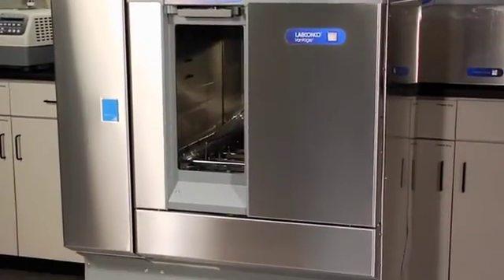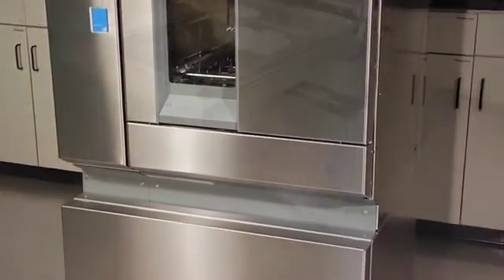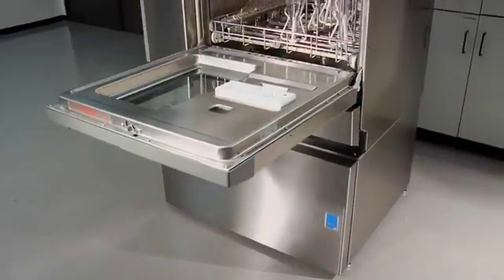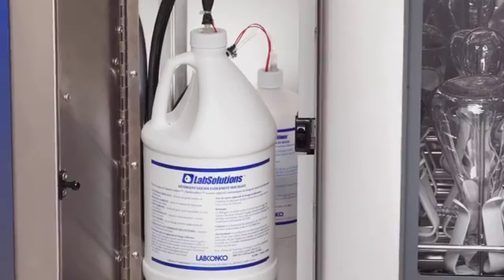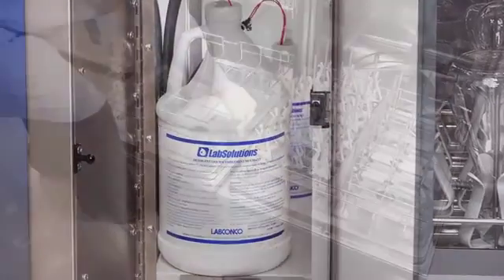The Vantage washer has added features such as HEPA filtered forced air drying, automatic liquid detergent dispenser, RS-232 port, and water conductivity monitoring.